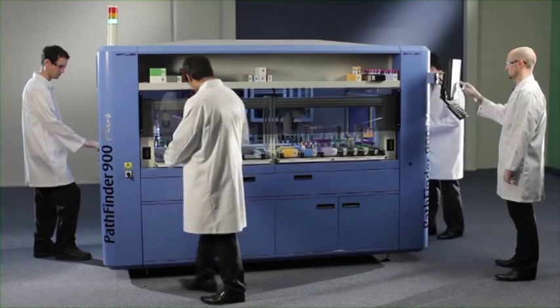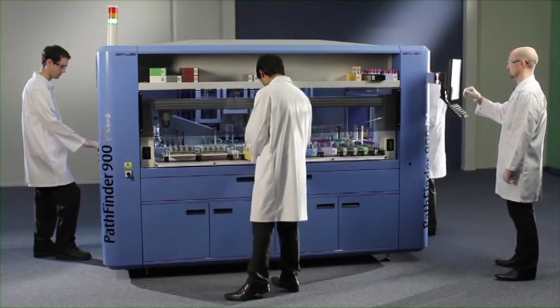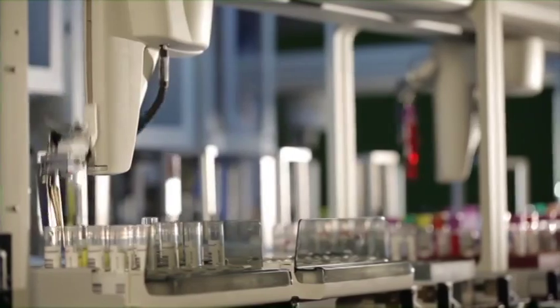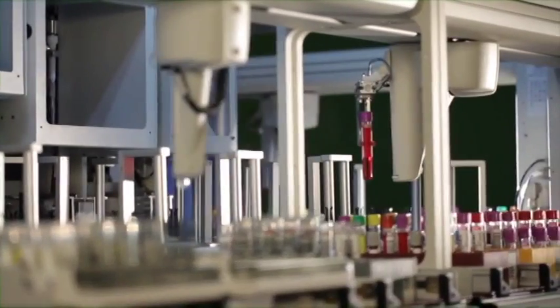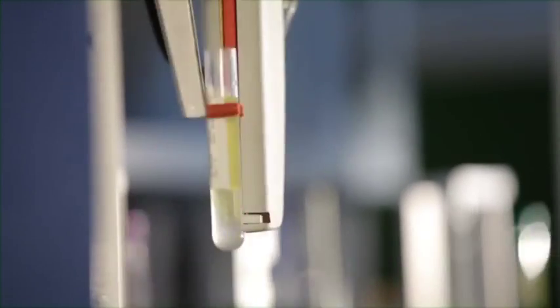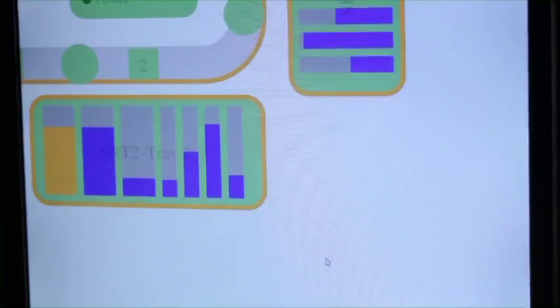The Pathfinder 900 Plus is a high-speed robotic system for automating the processing and management of sample tubes in a pathology laboratory. It automates a number of different manual functions.